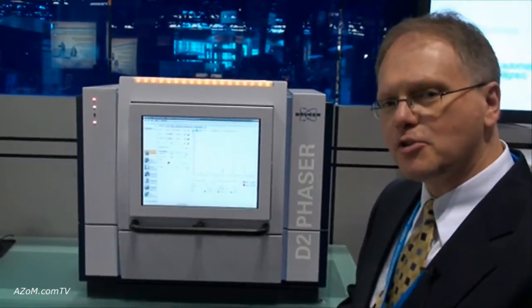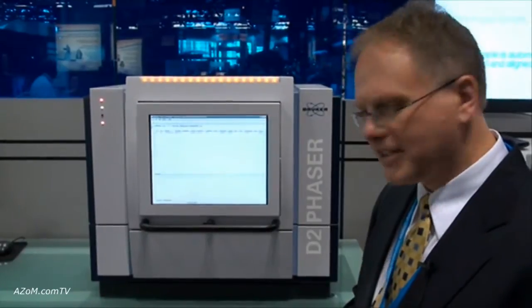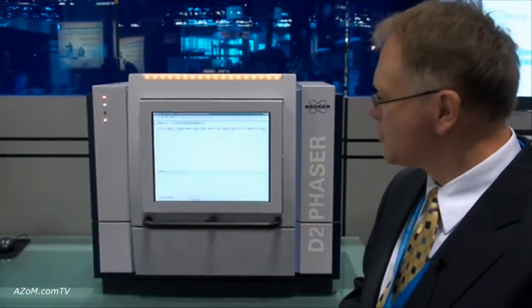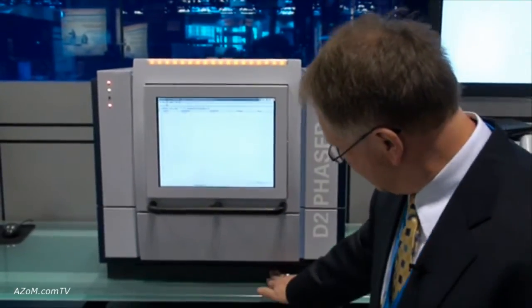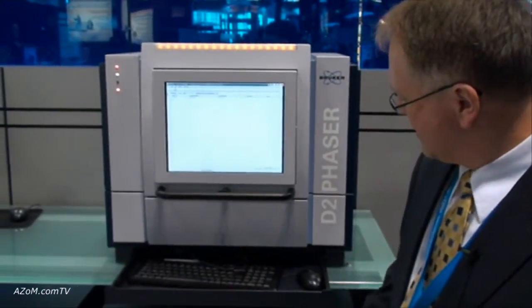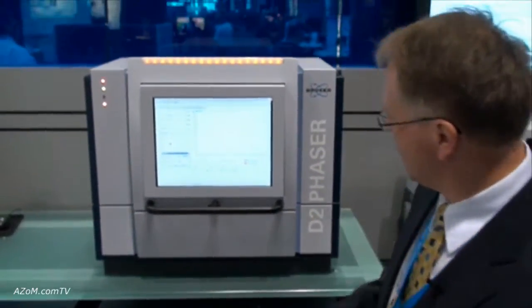The system weighs 200 pounds and has a built-in chiller, built-in computer, built-in screen, and a drawer for the keyboard — completely self-contained.